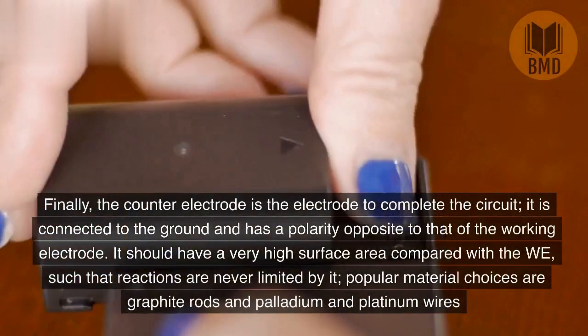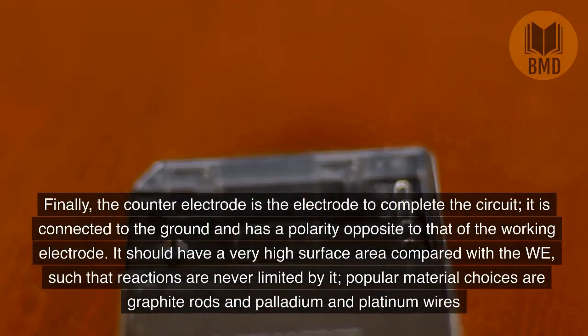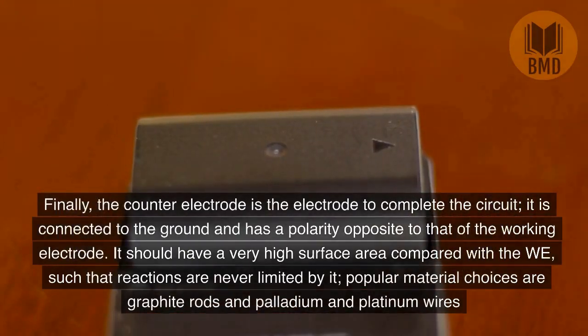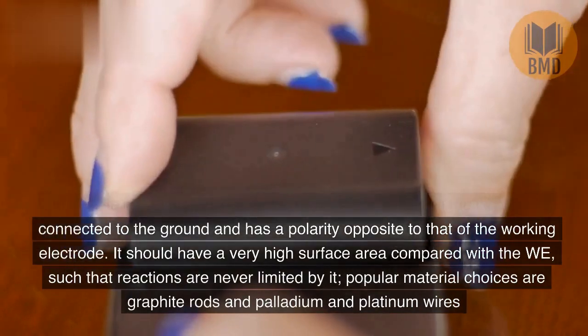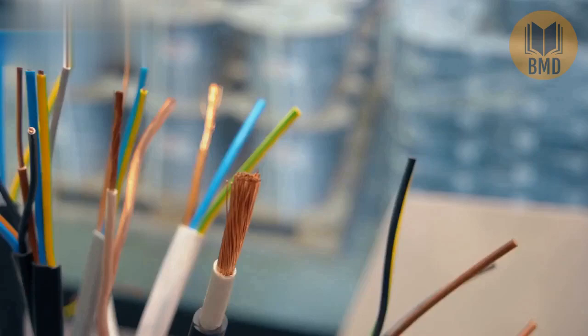Finally, the counter electrode is the electrode to complete the circuit. It is connected to the ground and has a polarity opposite to that of the working electrode. It should have a very high surface area compared with the working electrode, such that reactions are never limited by it. Popular material choices are graphite rods and palladium and platinum wires.